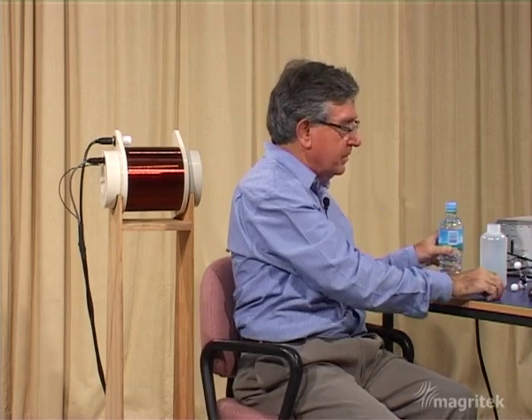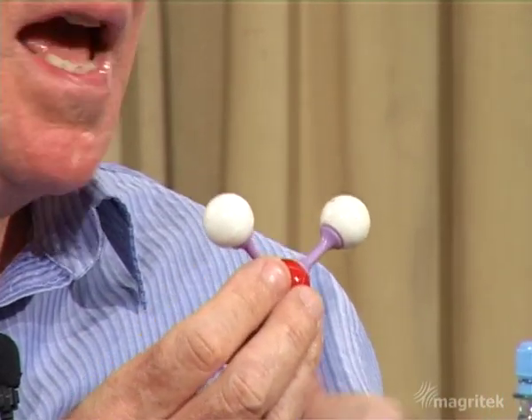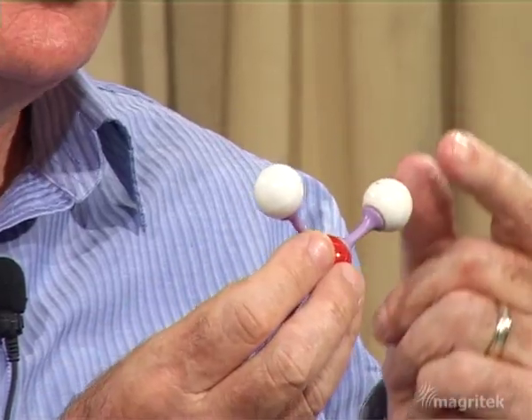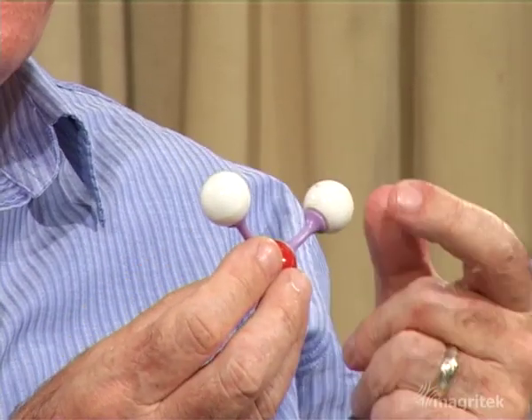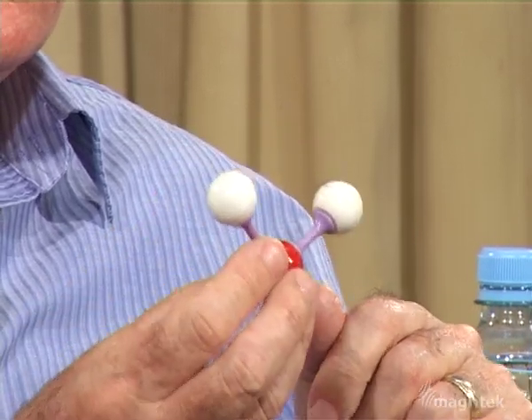So what is water made up of? Well, it's made up of molecules a bit like this. An oxygen atom, which at its heart has a nucleus, which actually has no magnetism and no angular momentum and plays no part whatever in the nuclear magnetic resonance phenomenon. But attached to the oxygen are two hydrogen atoms. And at the heart of those hydrogen atoms are atomic nuclei, which we call protons. And there's a large abundance of these water molecules and lots of protons available in the water sample that we're going to prepare today.